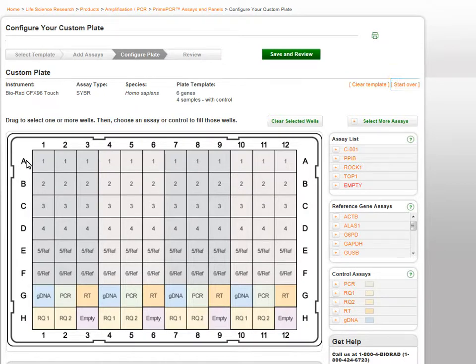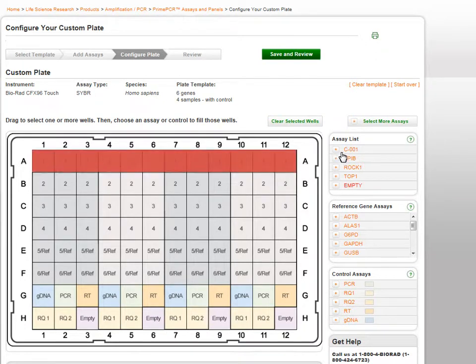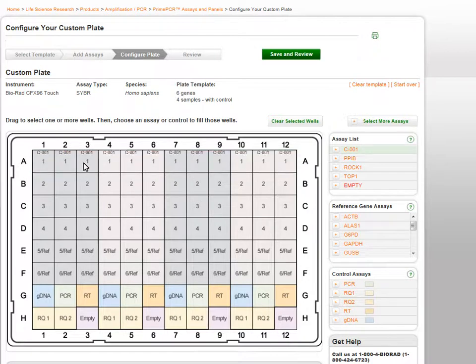For the template in this example, gene assays are in triplicate for three different samples. Click and drag to select all the wells marked 1. You can also double click the A to select an entire row. Selected wells will be highlighted in red. Click on an assay in the assay list at the right to assign a given assay to the selected wells.